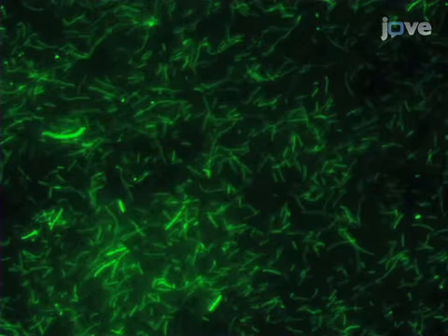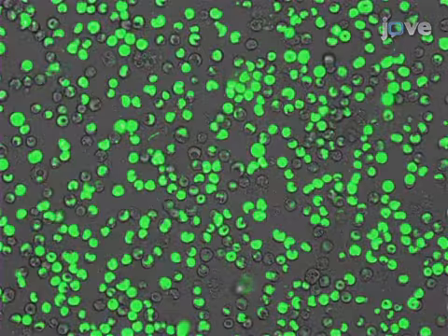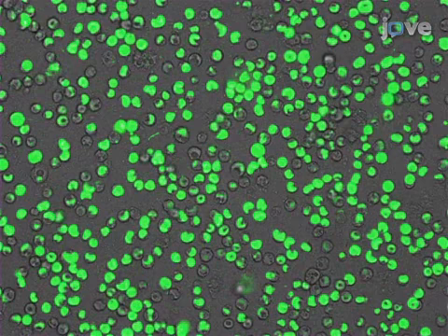We developed this technique by observing that the expression of particular virulence factors in bacteria could not be induced through in vitro cultivation alone. Typical infection models of cultured monolayers of cells use in vitro cultured bacteria. For Legionella and several other bacteria, protozoans provide a natural reservoir for proliferation where the bacteria gains a pathogenic advantage.